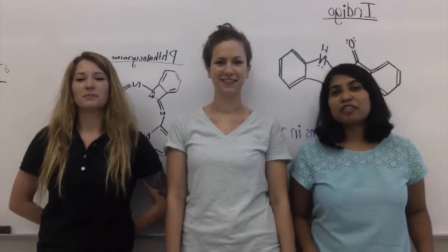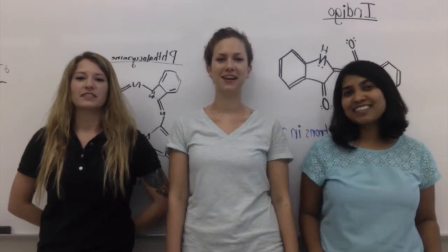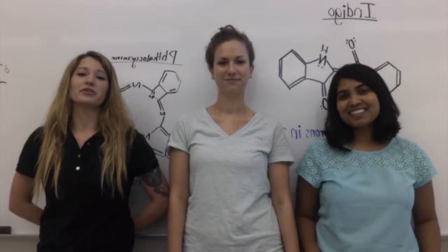And we are going to be talking about conjugation versus wavelength, color versus viscosity and acidity, how to use the UV-VIS, and general dilutions.